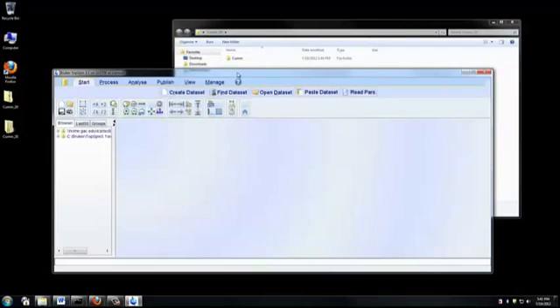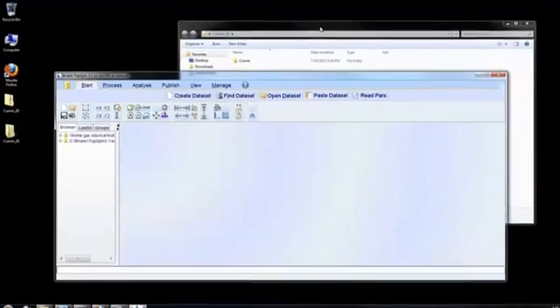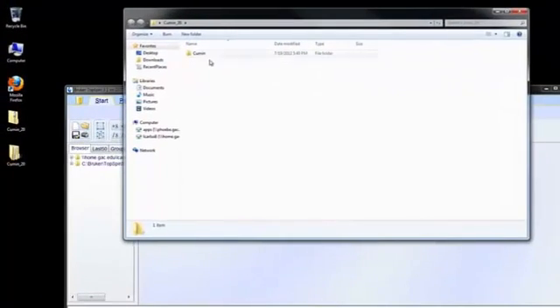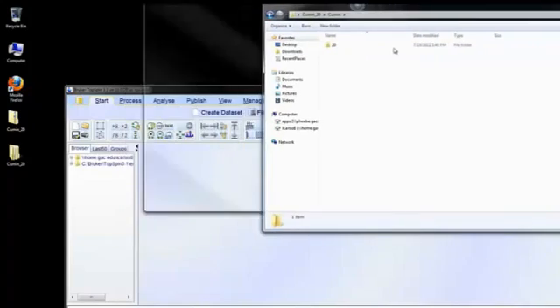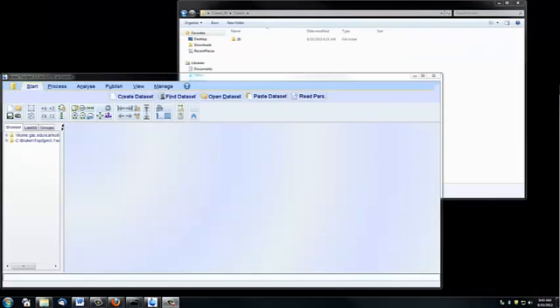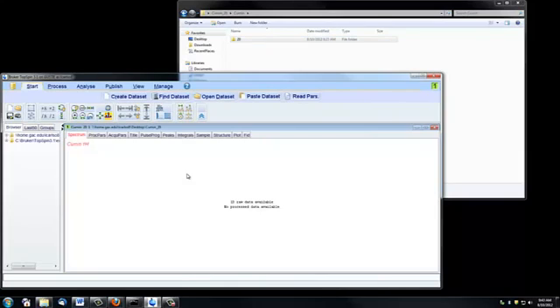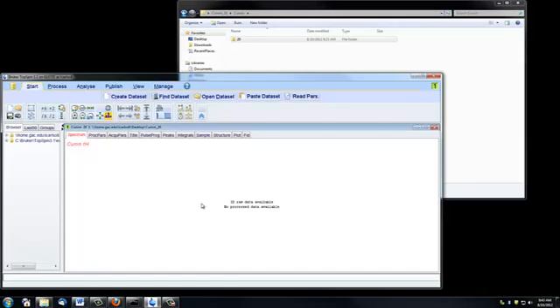So this is Topspin. The next thing I need to do is import the data into Topspin. If I double-click on this title, which is Cumin, I'll get to the actual experiment number. And I can actually just drag this file straight into Topspin. You'll notice that it says no processed data available, and that's because we haven't actually processed the spectrum yet.